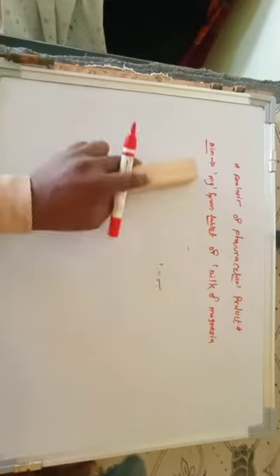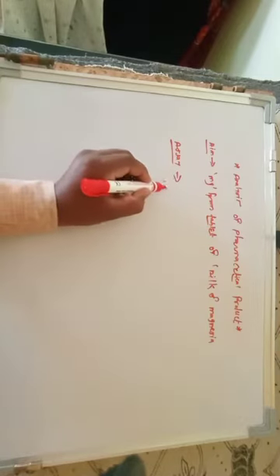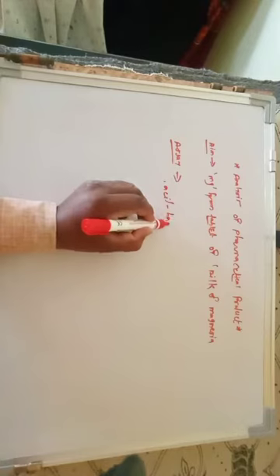Let us discuss the assay of magnesium hydroxide. How will you determine the magnesium or magnesium hydroxide? Assay means analysis. The assay of magnesium hydroxide, or milk of magnesia, follows an acid-base reaction in which a standard acid is used.